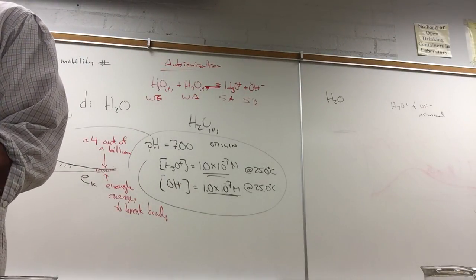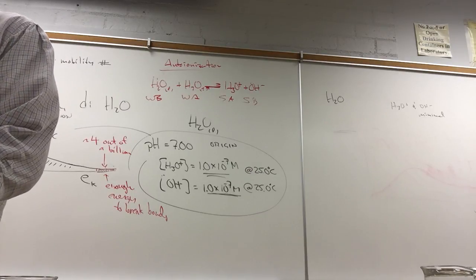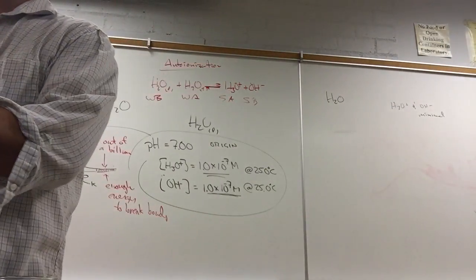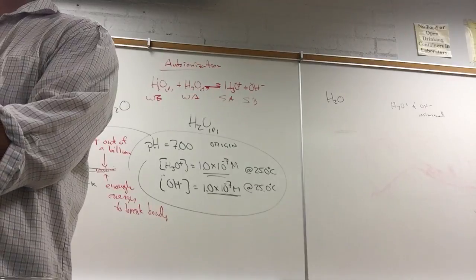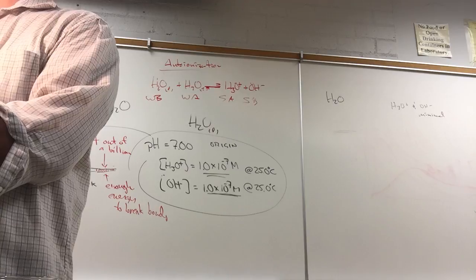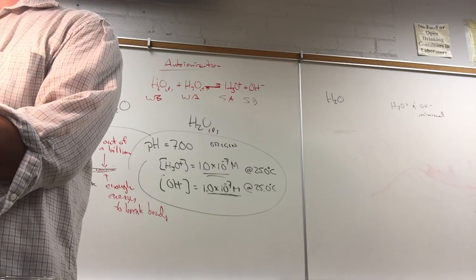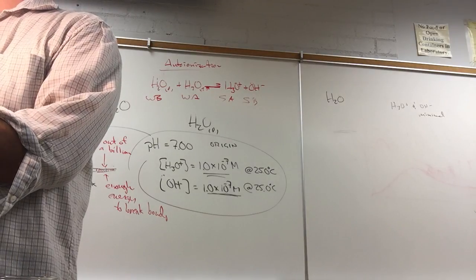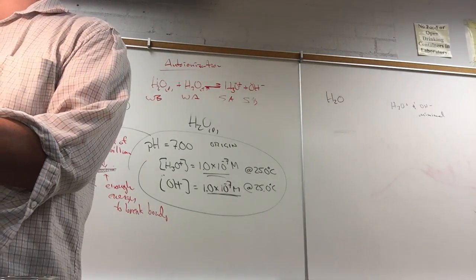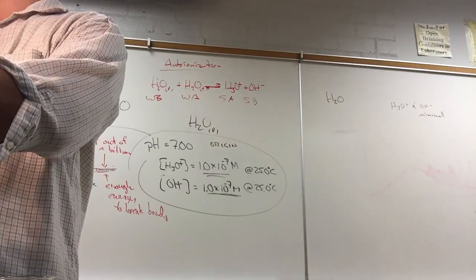Sodium chloride, salt water. Does tap water taste salty? No, but you can taste the minerals. The minerals give it flavor. But salt water, this is 1 molar, is going to taste very salty. Let's take a look here. You see that? Salt water is an excellent conductor. What happens if I dilute the salt water? This is 1 molar. 1 molar conducts electricity as good as copper wire.